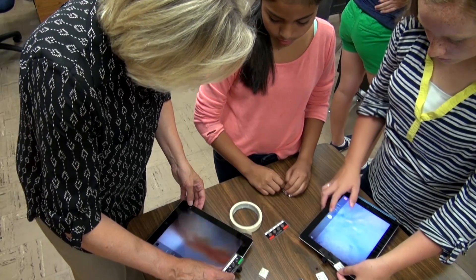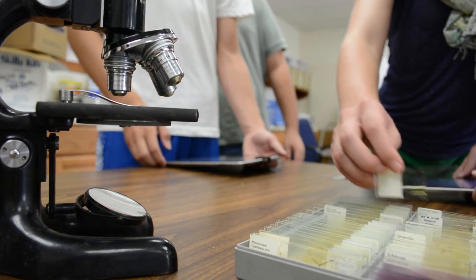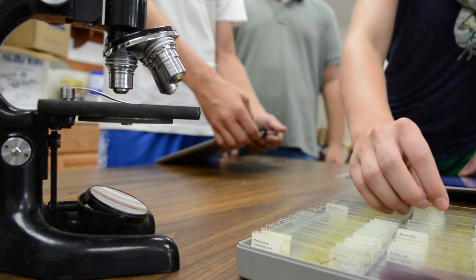I think for education it gives opportunity to all sorts of different backgrounds, be it elementary school all the way up to high school, and even just a career scientist too. The ability to look at microscopic organisms easily without having a big bulky microscope is a beautiful thing.